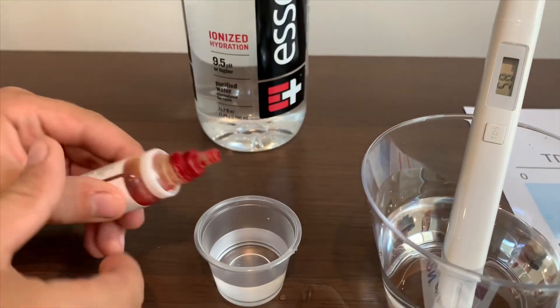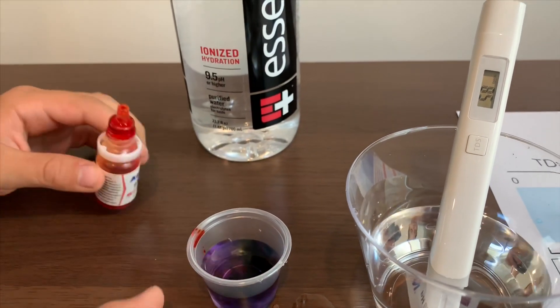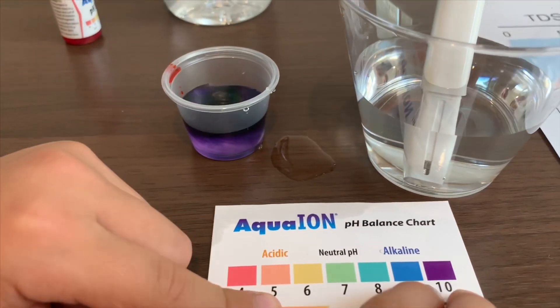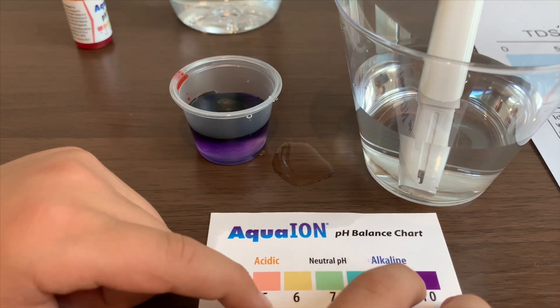Now let's test the pH. It is 10 pH water, which means it's alkaline water.